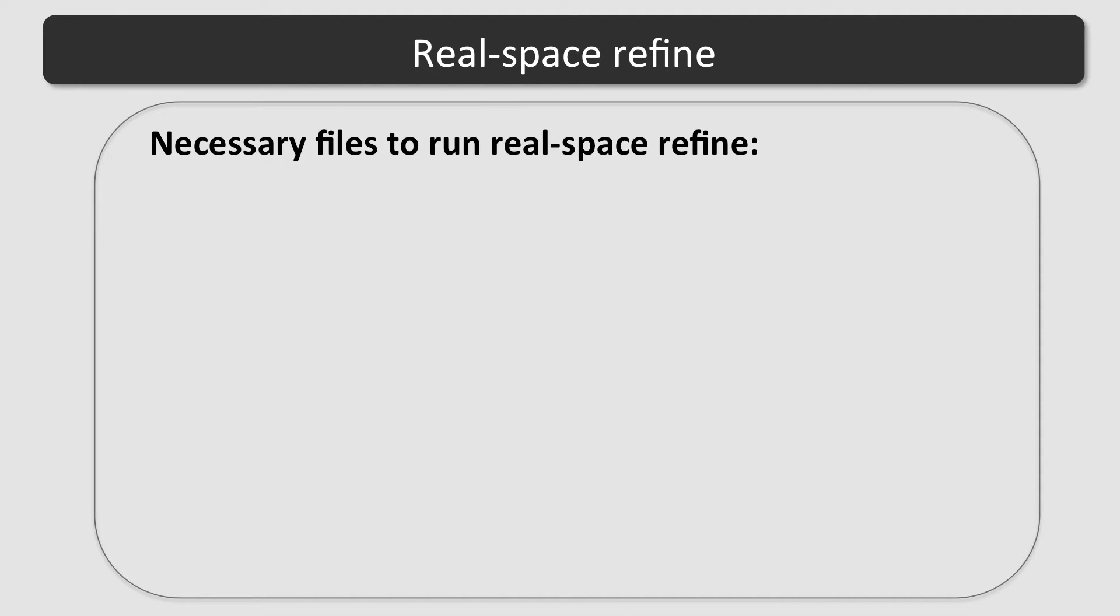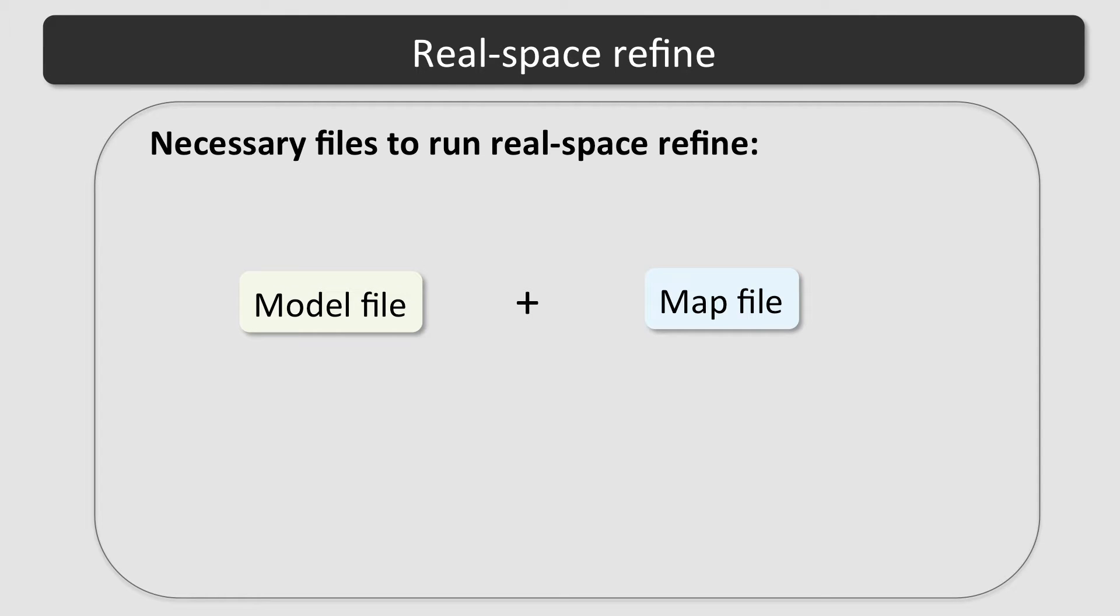To run RealSpace Refine, basically two input files are required, a starting model and a map file. For the model, different formats are supported, such as PDB or MMCIF.